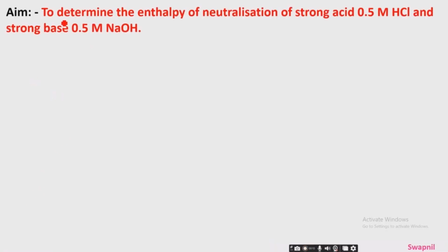So let's start. The aim is to determine the enthalpy of neutralization of strong acid, 0.5 molar HCl, and strong base, 0.5 molar NaOH.